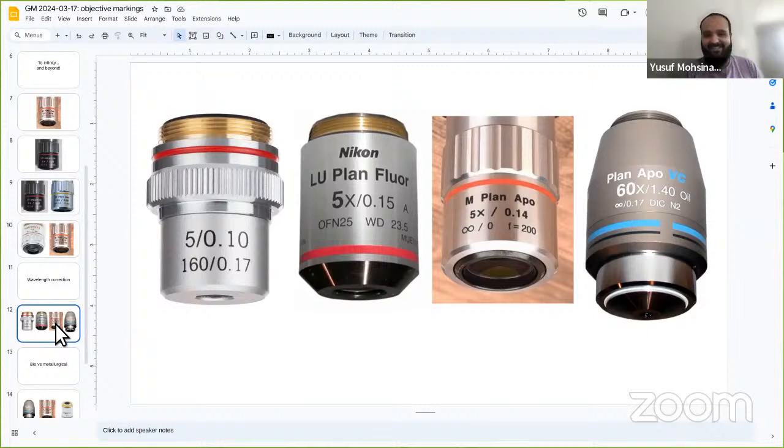I forget what VC stands for, but it's very cool or something. So that one is corrected, I believe, to 4 wavelengths. So another way to think about it is not only is this super high quality correction, it's corrected with kind of a higher CRI even than the other ones, is maybe a way to think about it. Because even when you try to do this, there's still a lot of trade-offs. Some things are going to correct a little bit better, but the more points that you can collect on that curve that are perfectly corrected, the better and better that you can get of optical corrections. So maybe take a step back there and see if any questions, thoughts, based on that series.